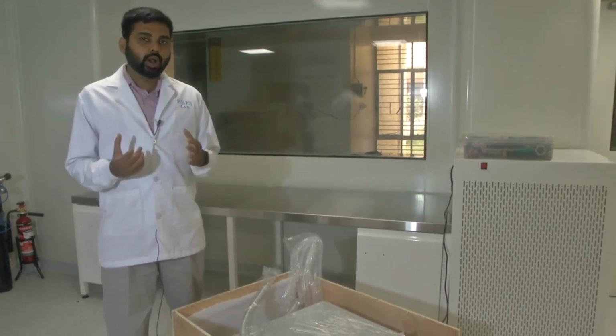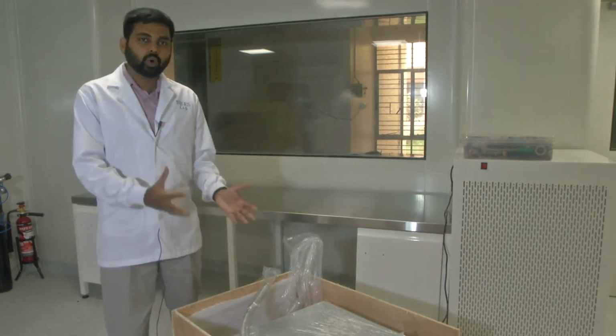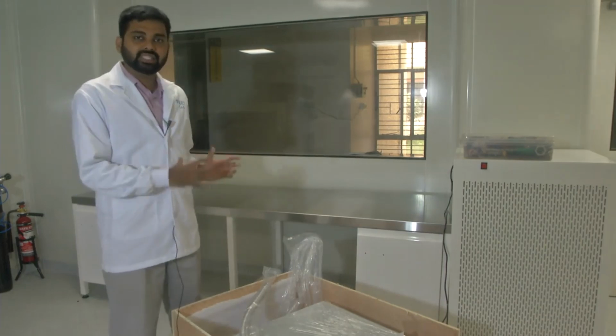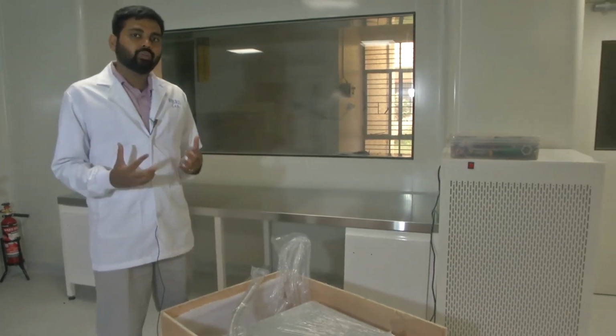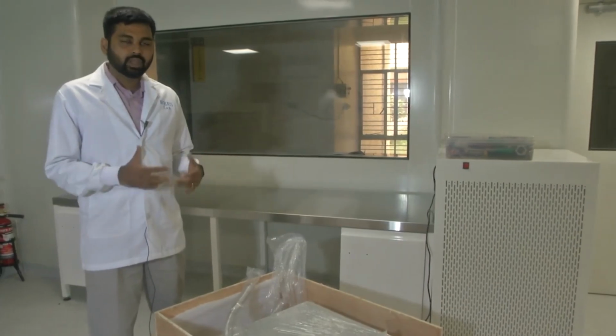So we will be showing you a bonding process eventually, but the first step is we will actually open up this carton and set it up here, so that you know, when you set up a clean room, what are the processes involved, what are the things that you should take care of while you set up a system.